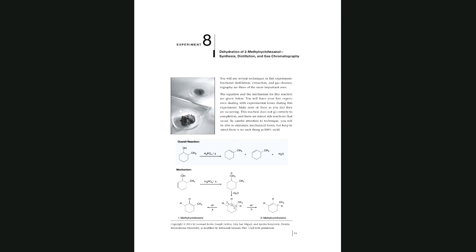I know I've done simple distillation and fractionals. So I'm using the fractionating column here with the steel wool in.